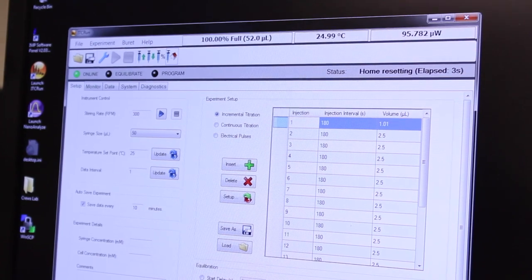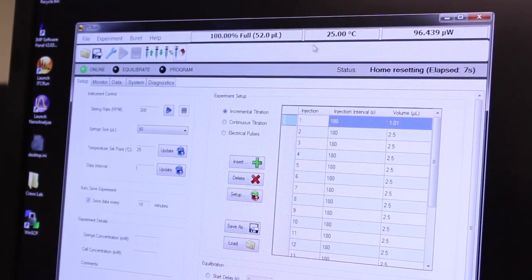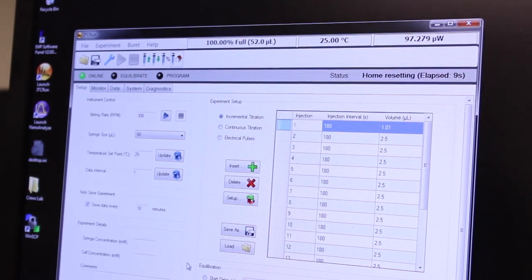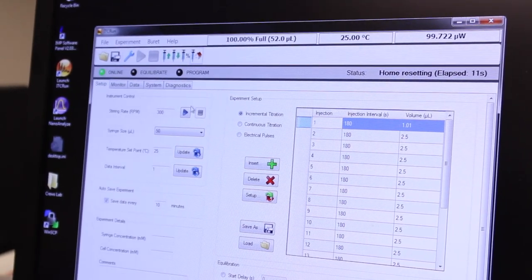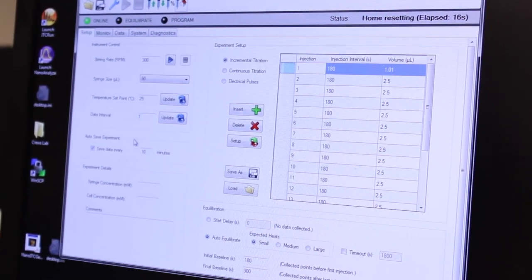This will allow the instrument to continue equilibrating so that the temperature will be more stable and equilibrated for the next user. If you don't leave the program running it will not be actively equilibrating and regulating the temperature and it will take significantly longer to achieve a stable baseline for the next user.